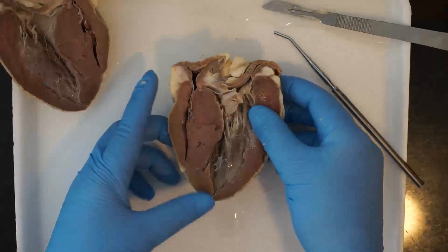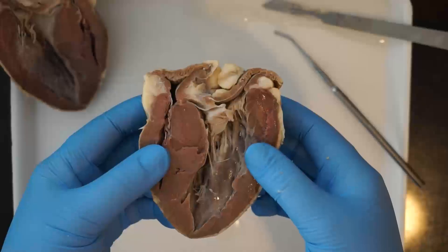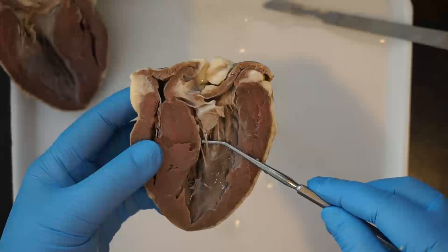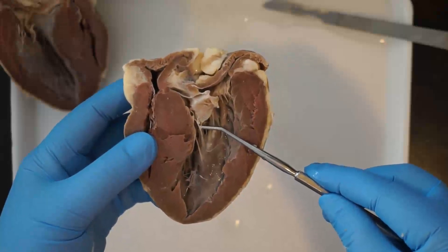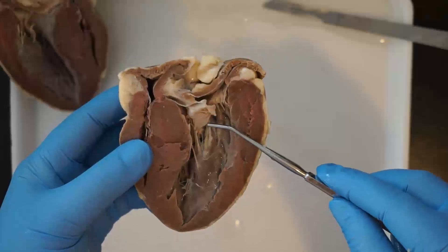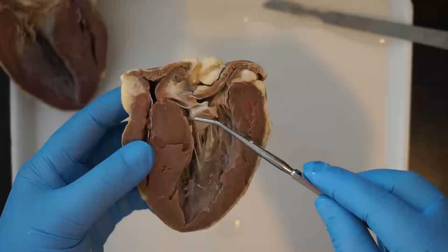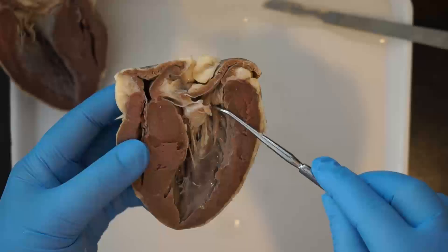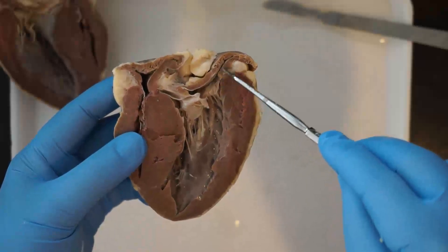Looking at some internal anatomical features, the first thing you can see are the chordae tendineae, which are those thin pieces of tissue. Those are responsible for holding the valves in place. Right here you can see this flap of tissue is the bicuspid valve, which separates the left atrium from the left ventricle.